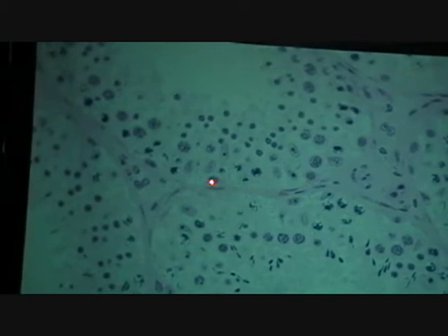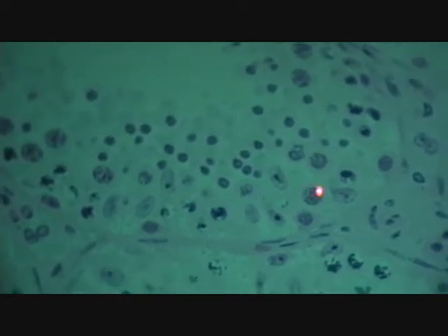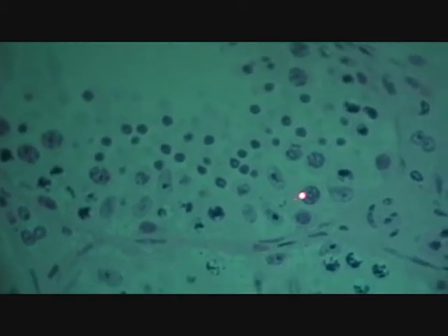All we'll do, start at the wall, say that begins the spermatogenic process. Nice big round nuclei, very active mitotically. So these are the spermatogonia, sometimes just called gonial cells. They divide, and then these develop to start showing their chromosomes. You see that worm-like appearance in the nucleus.